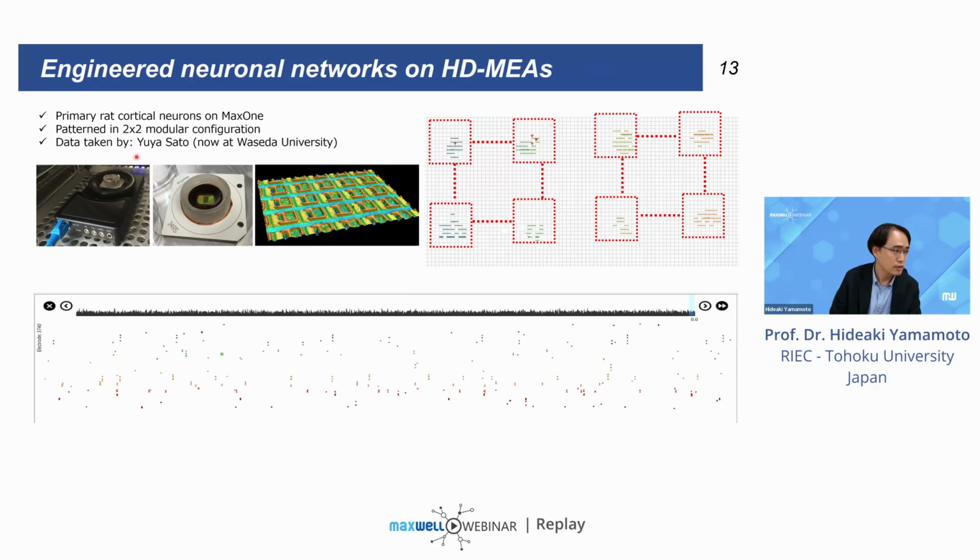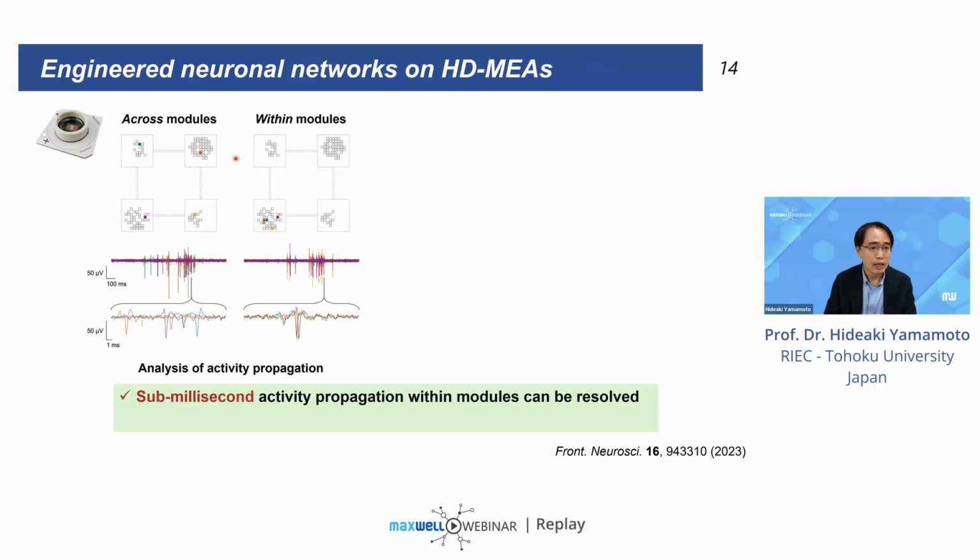And the data here was taken by Yuya Sato, who is now at Waseda University. And what is really cool here is that high-density MEAs allowed us to capture not only the propagation of activity across separate modules, but also the propagation within individual modules that occur in sub-millisecond timescales. And these were something that we previously could not resolve by calcium imaging.